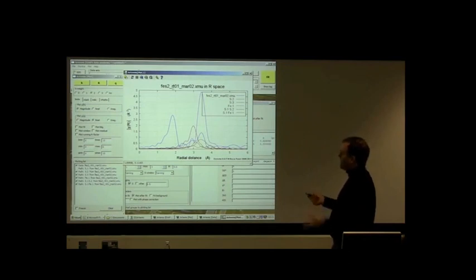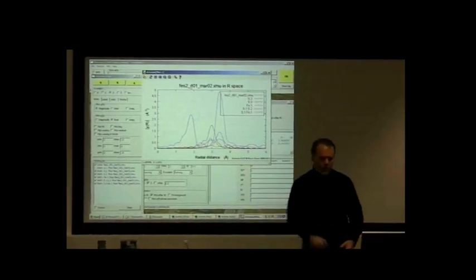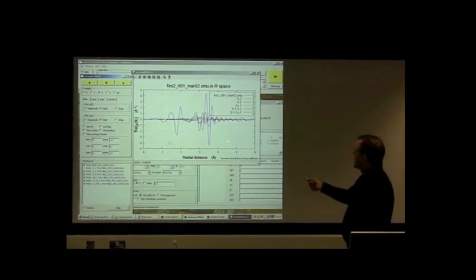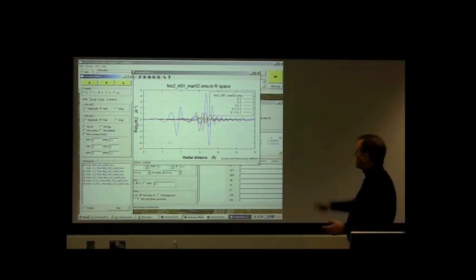Now, I should point out also that the situation isn't quite so simple as sigma squared not yet being evaluated. There's some kind of phase relationship here. So if we look at the real part of the Fourier transform, we see that there's some kind of complicated phase relationship between all of these things. So it's not just that those magnitudes are all going to add up with the appropriate sigma squareds and S0 squareds, but all of these oscillatory functions, parameterized correctly, are somehow going to add up to be the blue spectrum.